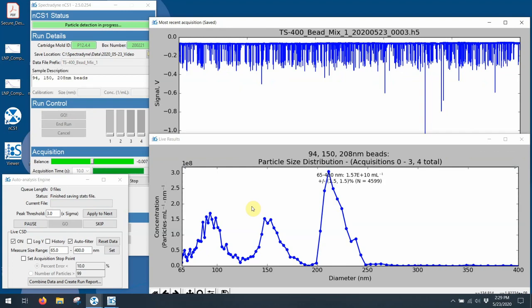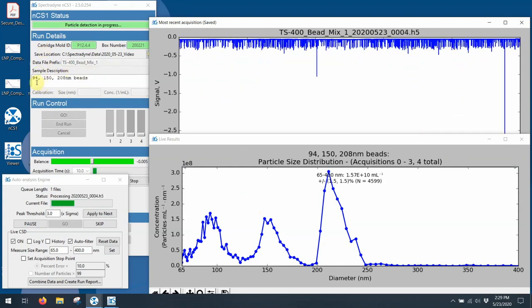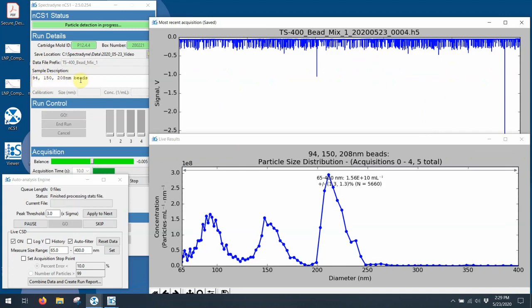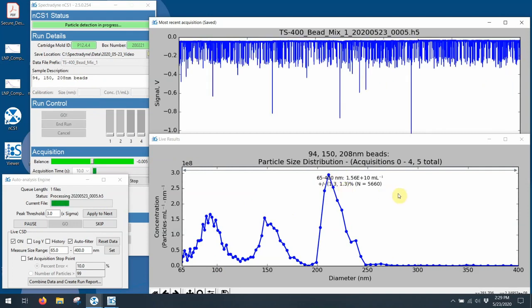Now, as I said before, when I put this sample in, this consists of 94, 150, and 208 nanometer beads. And you can see that we're coming out just the way we would expect to with a 94, 150, and 208 nanometer beads.